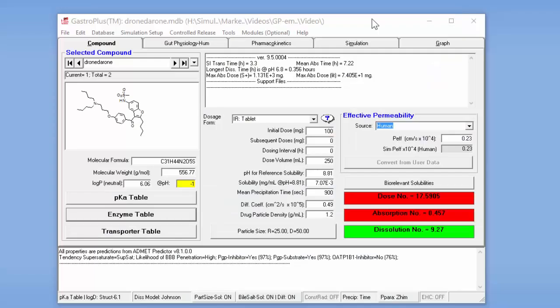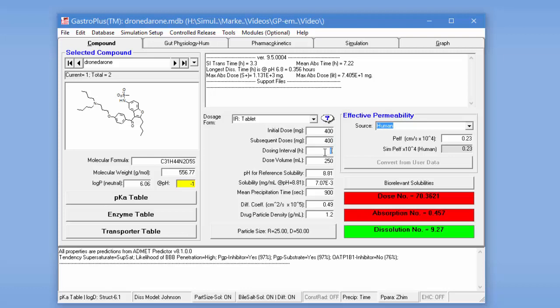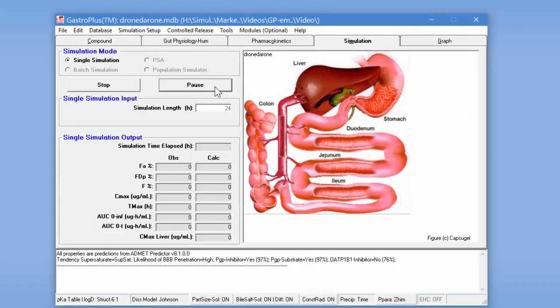Now that the enzyme table is set up, we're ready to perform a simulation and we're going to do a 400 milligram dose twice a day. So the subsequent dose will be 400 milligrams and then the dosing interval will be 12. I'll go to the simulation tab and then simply click on start to start the simulation.